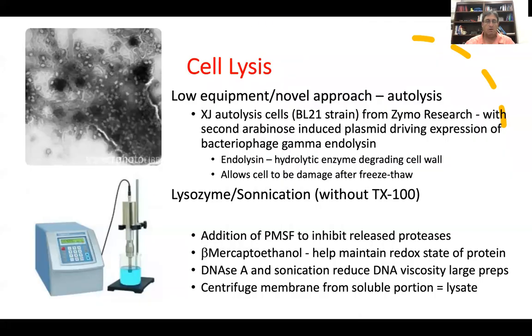All right, so now we've spun down the cells, and we have this cell pellet. Some people take that pellet and combine all the various tubes of the same prep into one tube, freeze that in a Falcon tube or some other kind of tube. Some folks will scrape that out and then put that in even a Ziploc baggie and then put that in the freezer with just the paste. And that way you can take that out frozen, open that, and then start from there. So you can store these cell pellets in the freezer, and that works out really well.